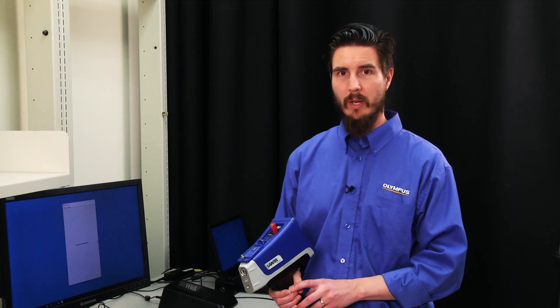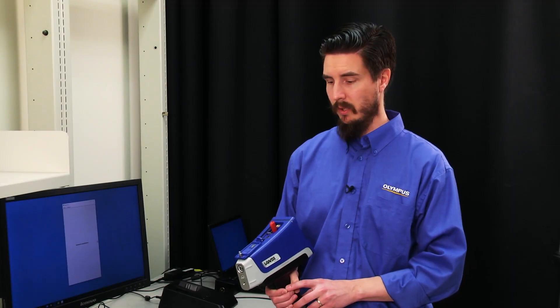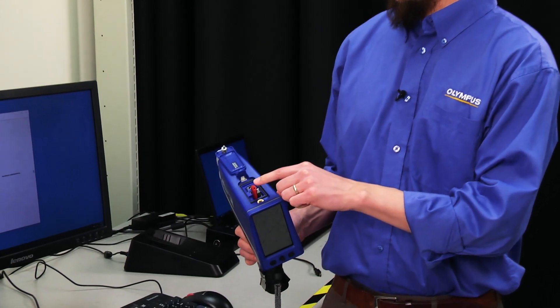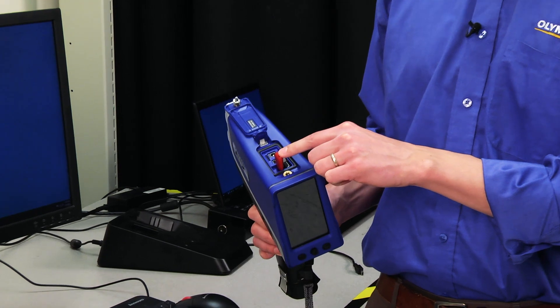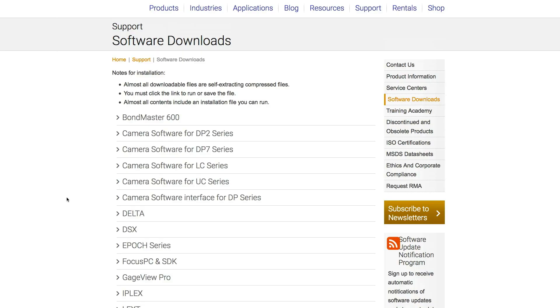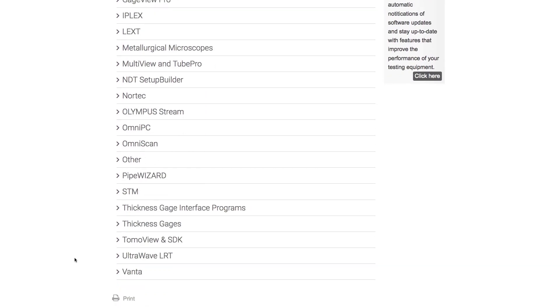Now I'll show you how to update your Vanta software using a USB device. With the instrument off, insert the USB device with the software installed on it. You can find the software on the Olympus IMS website under Resources.